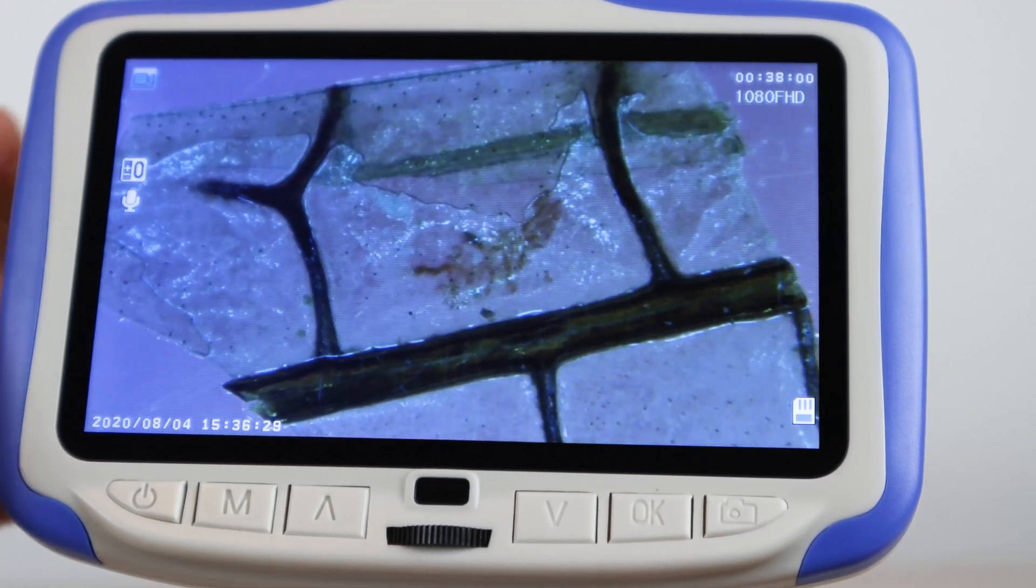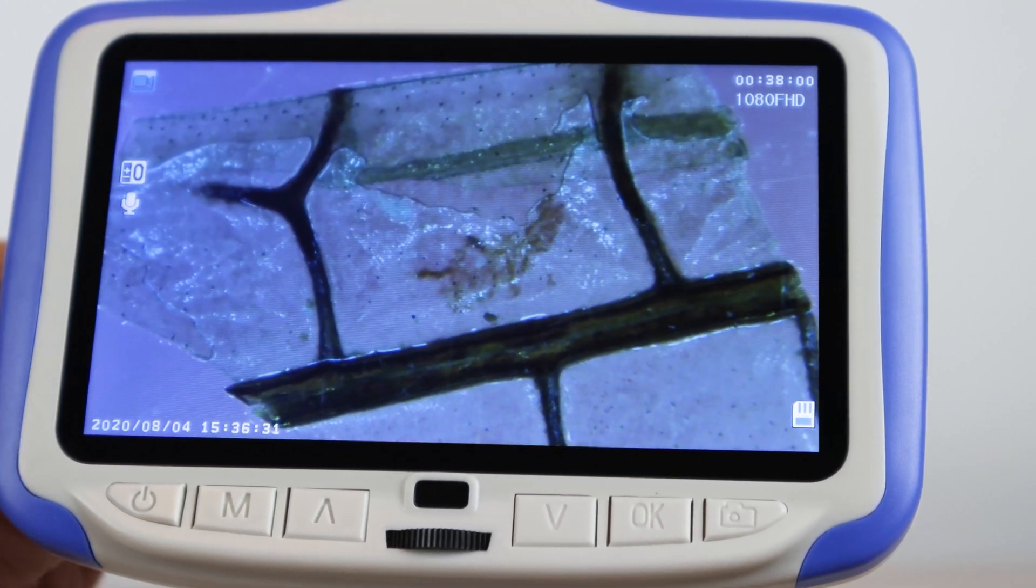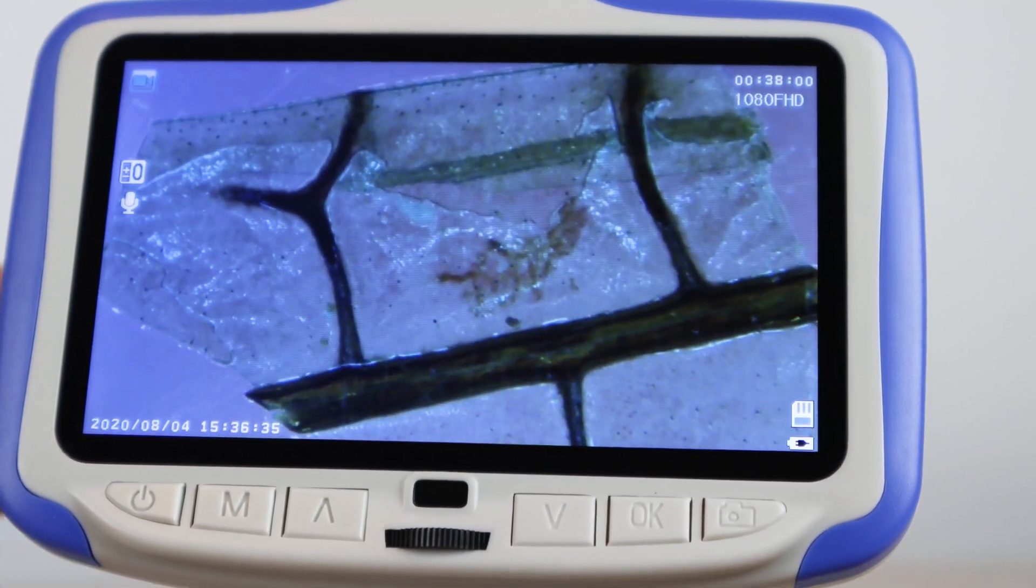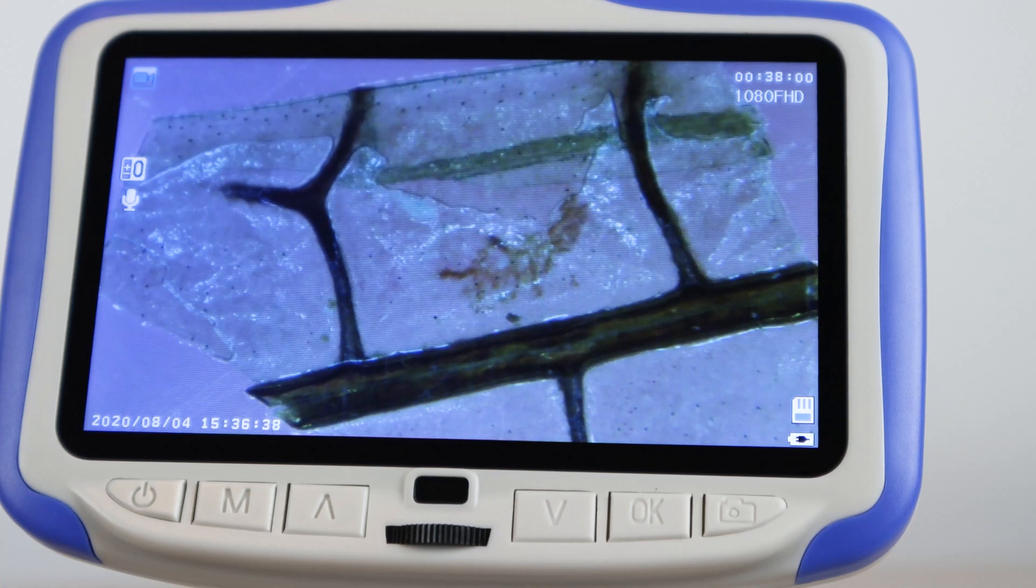With the solid white filter, we see more textures because the light doesn't pass through the sample from the bottom but is instead reflected off the top surface back towards the lens.